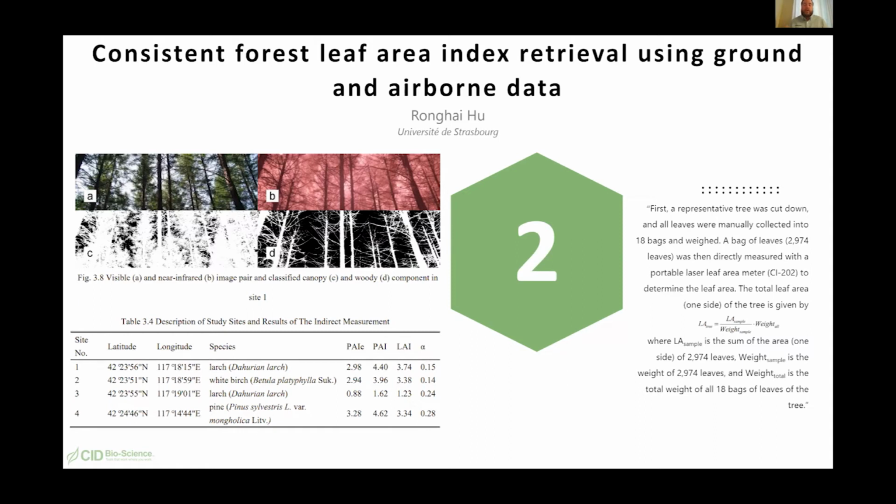And so by getting the leaf area of the tree, he was then able to get the leaf area of the entire region by further extrapolating and using more mathematics. And from there, using that as the established direct measurement, the defined leaf area, doing it the classical way, as classical as can be, but basically speeding up his process by utilizing the 202 instead of having to take a ruler out and measure every single parameter of these leaves.